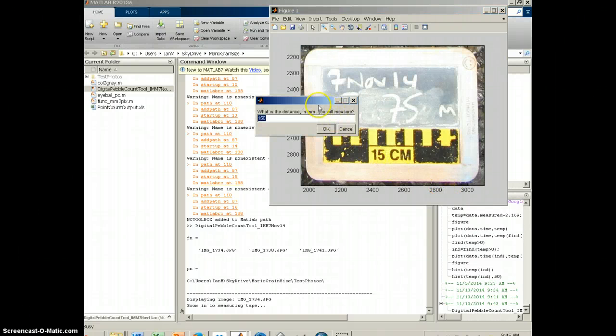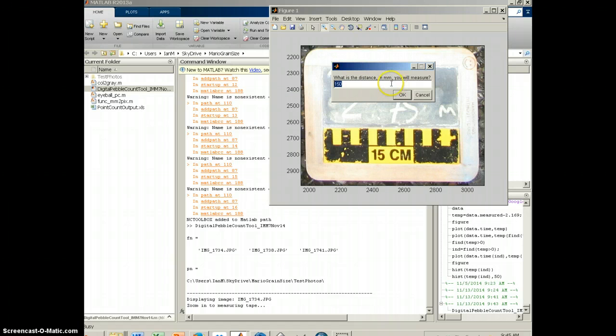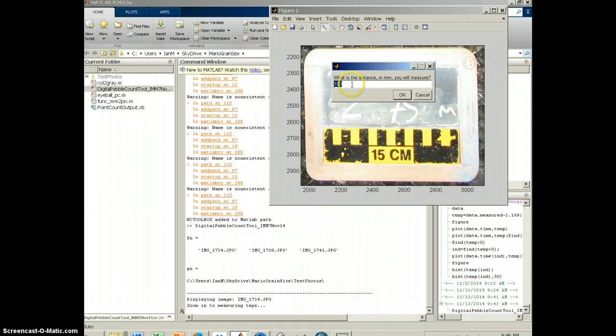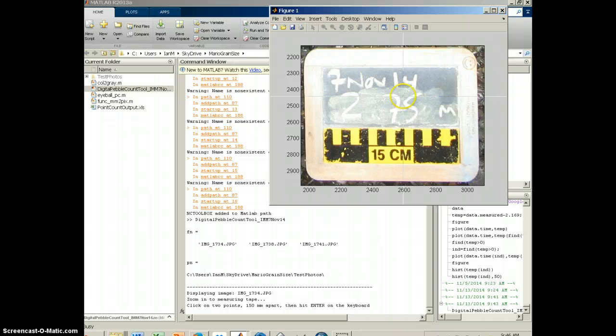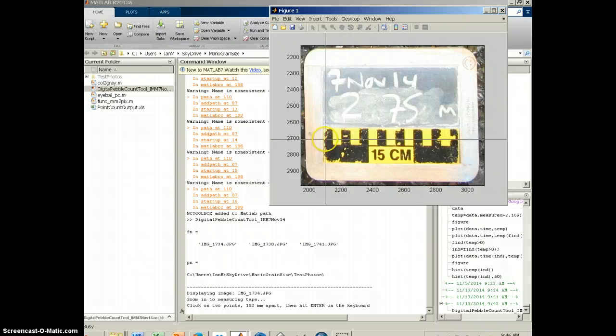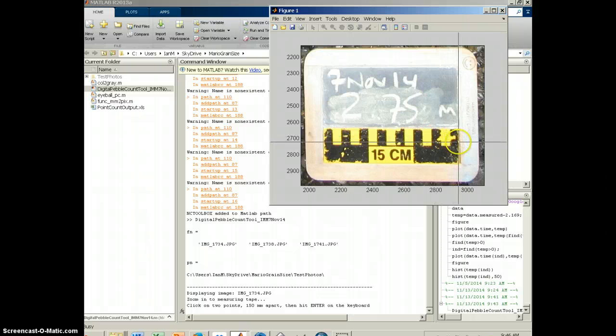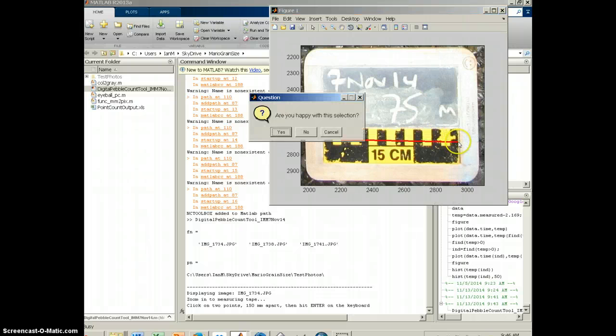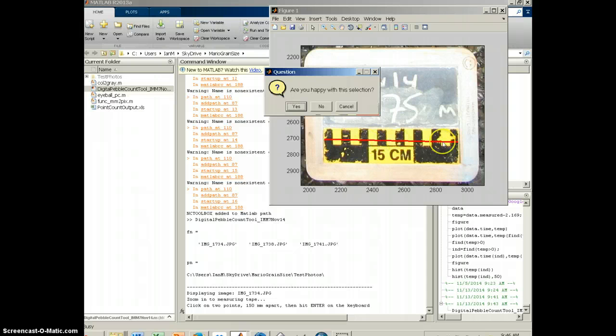Then it's going to open up a box that asks what's the distance in millimeters I'm going to measure. This is a 15 centimeter scale, so that's 150 millimeters. That's preset in there, so I'm just going to say okay. Then it gives me this zoom or measurement tool in which I'm going to click on one side of that scale and go to the other side, click. It's going to draw a line across there. If I'm happy with where I've clicked and indeed this is measuring 150 millimeters, I'm going to say yes.